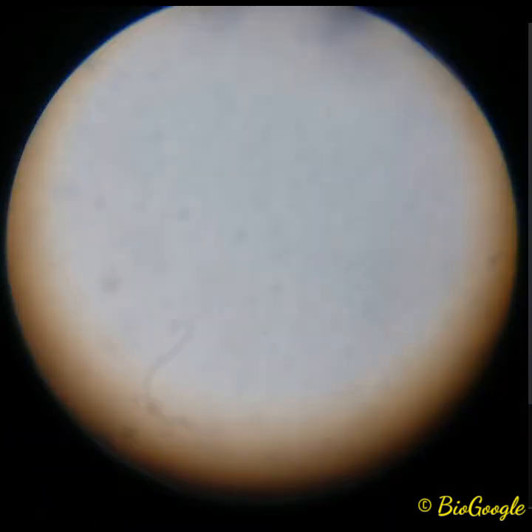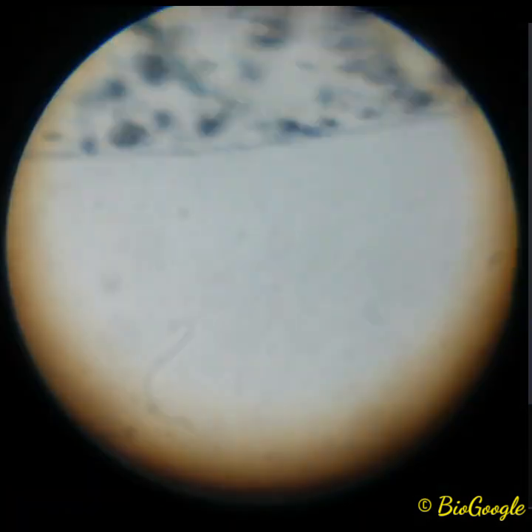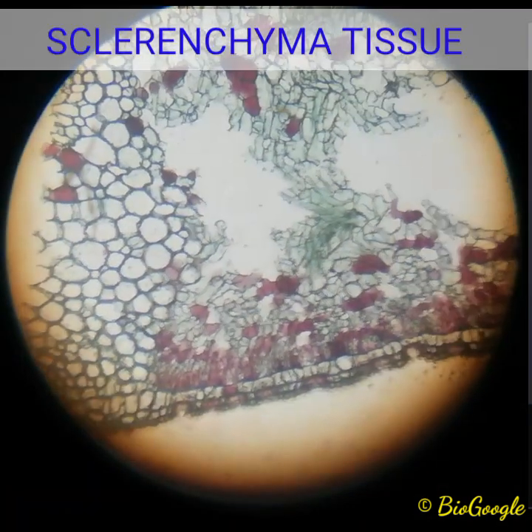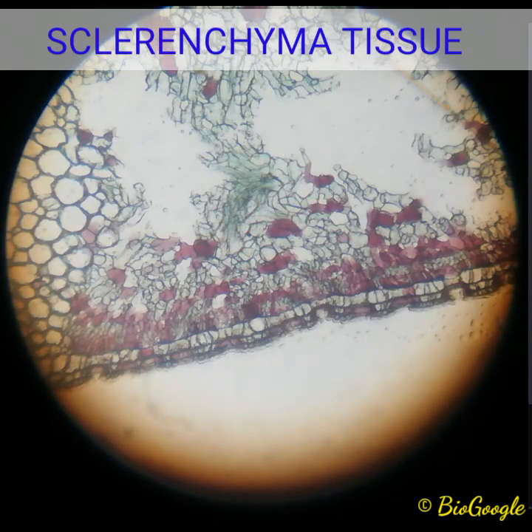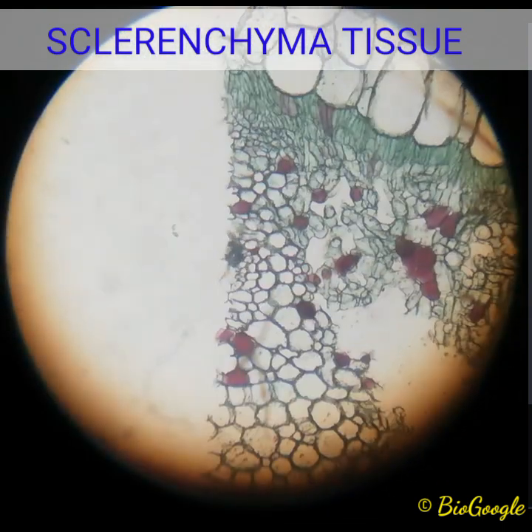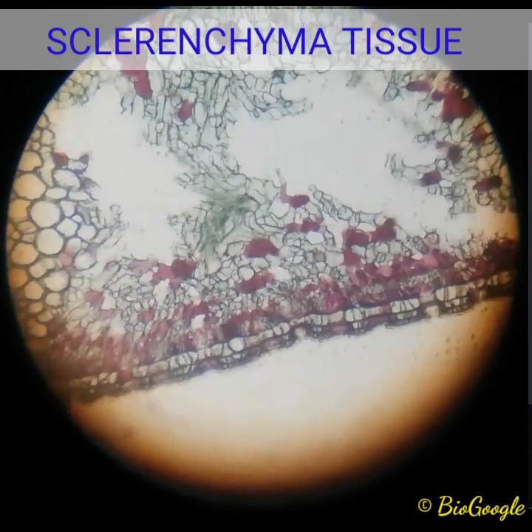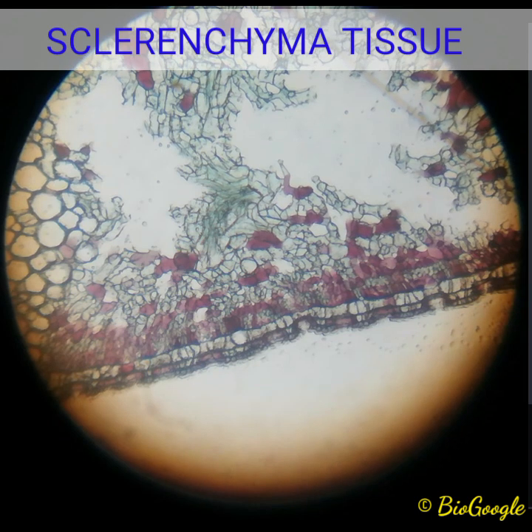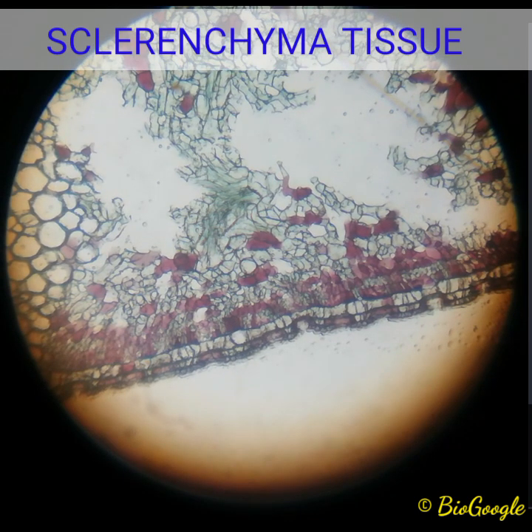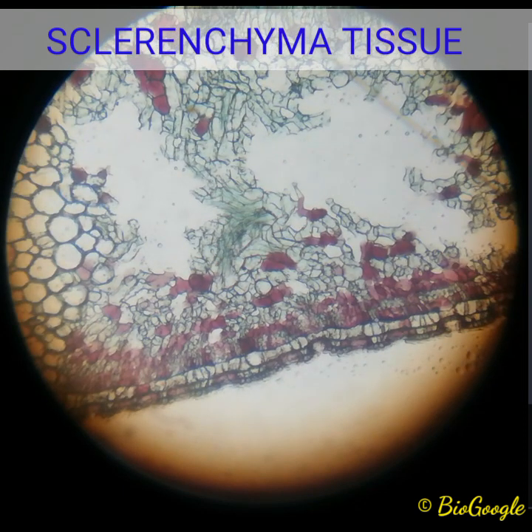Moving on to the next slide: sclerenchyma. Here you can clearly see more amount of thickenings throughout the cells, throughout the plant tissue. It is a leaf material — you can see the deposition of lignin in a greater amount. Hence it is a mechanical tissue, but remember it is a dead mechanical tissue. The cells are dead, they do not have protoplasm, the walls are thick, and the walls have pits.